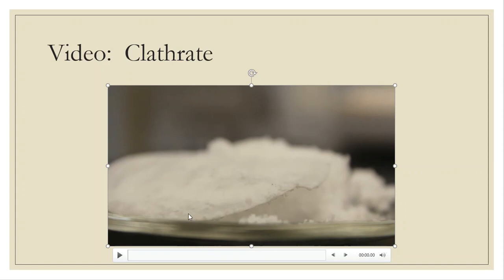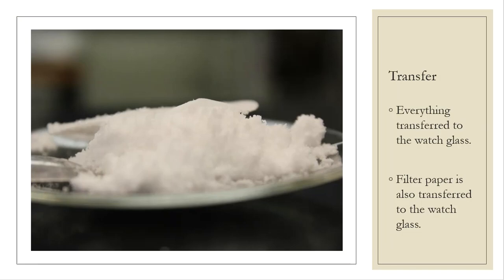Okay, so these are kind of important observations and numbers because part of your lab procedure is going to ask you to calculate the theoretical yield of your clathrate. All right, so that's what our clathrate is right here. So that's why we did a mass of it. That's why we dried it. That's why we went and put it on a balance. And now it's going to be my job, because there is trapped alkane in those crystals, and I need to dissolve those crystals and free up that alkane at this point. And then that way I can do a measurement of the alkane as well.